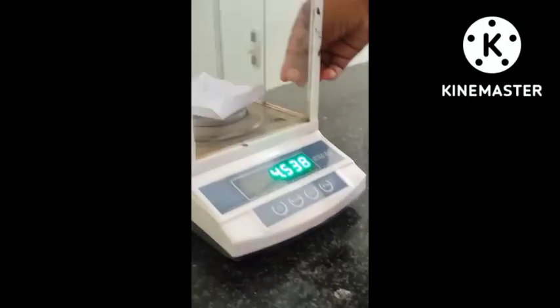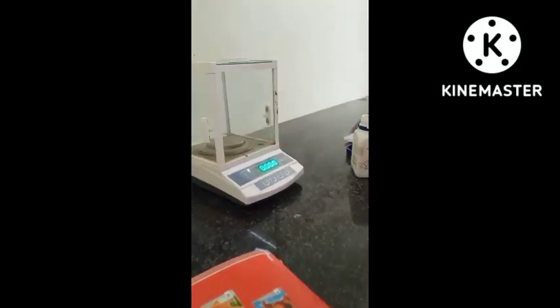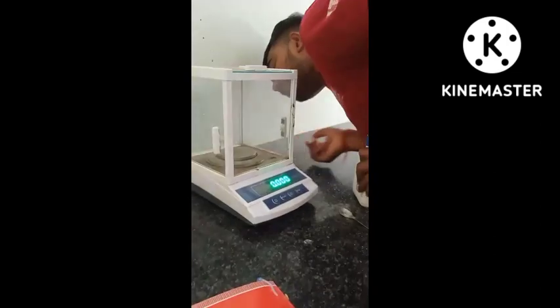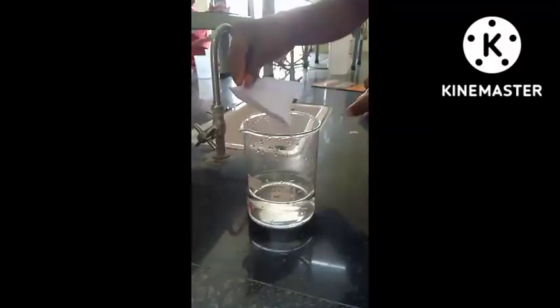Again, one more thing, in a lab we should always keep our bottle caps tight. We should tighten our bottles because they are very costly, plus they are very important too. This is again the process we are performing for oxalic acid for one more 2 grams. So it is done completely.